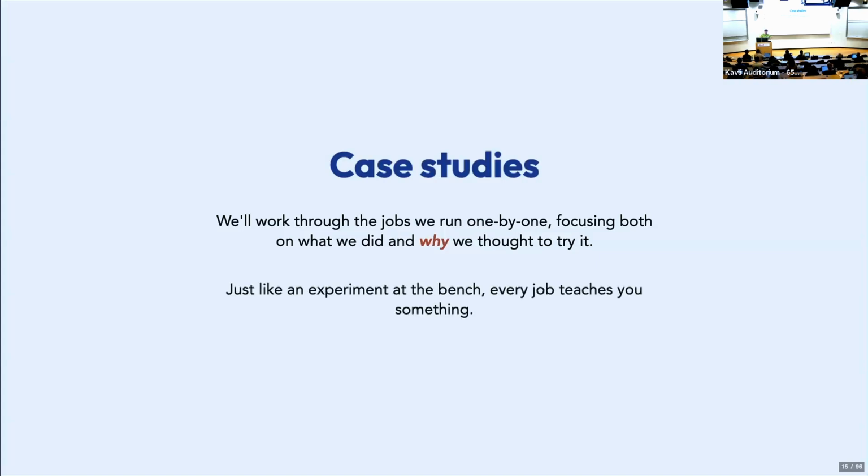Just like an experiment at the bench, every job teaches you something, right? So you launch some job, it gives you a map that looks horrible. You can sit and think, why did it look bad? What did that job do to the particle images, right? And then why did that make the map look worse? And so what job should I run instead?